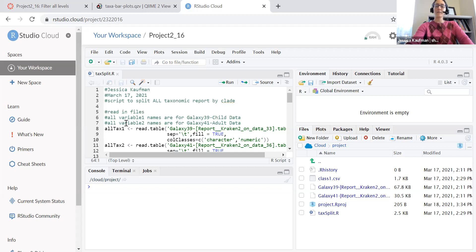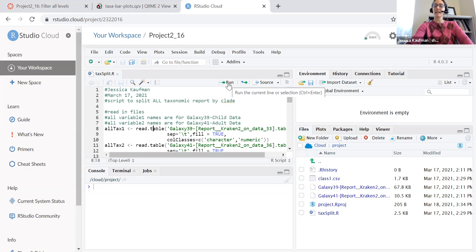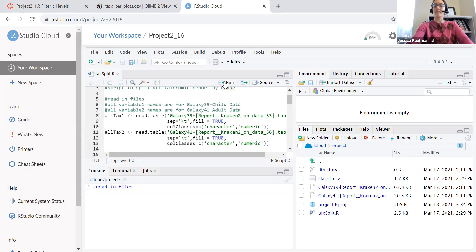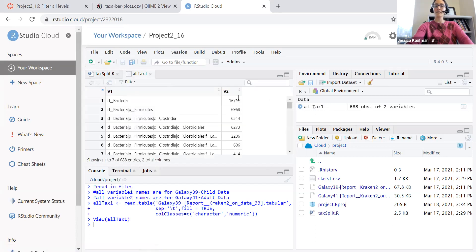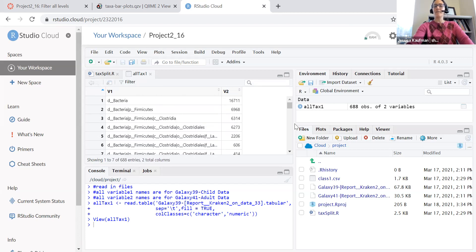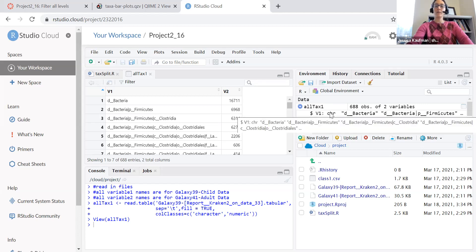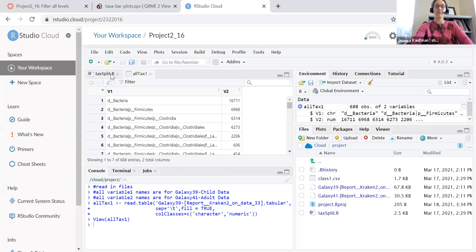As I make my script, I'm going to have all number one variable names correspond to the child data and all two variable names correspond to the adult. So the first thing I'm going to do is use read.table where I specify the separation, the fill, and the call classes to make sure that everything reads in neatly. I can see that this is indeed two columns. And if I click on it, I can see that the columns are being read cleanly. If I click on the blue circle, I can even see that the types are correct. V1, that first column, is character and V2, the second column, is numeric.